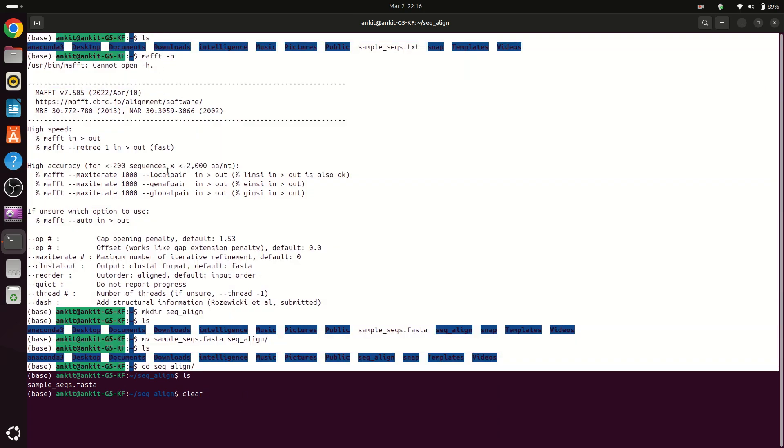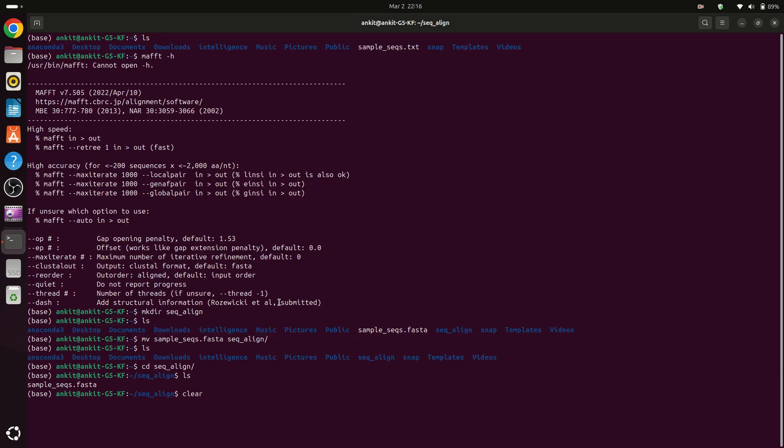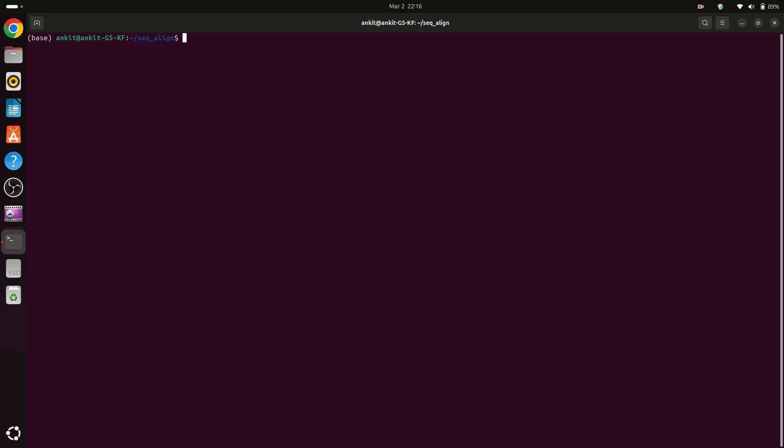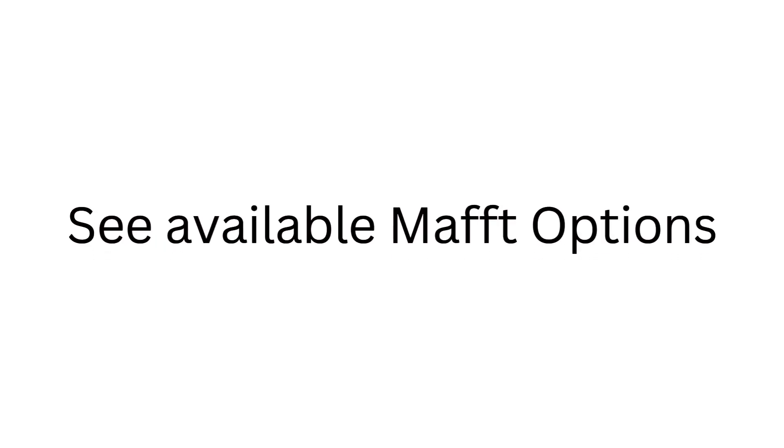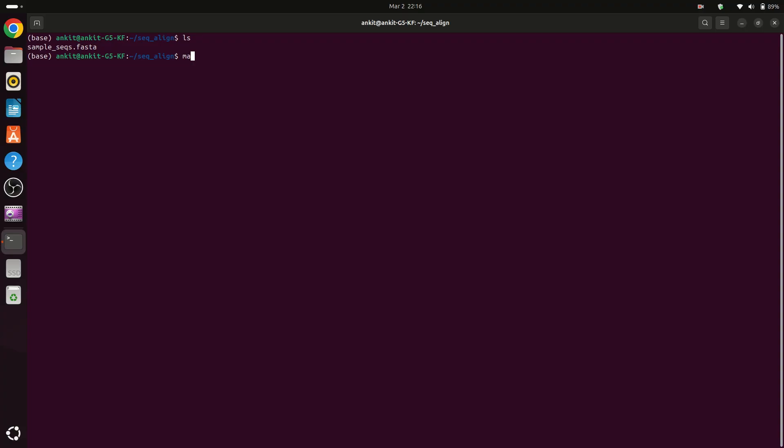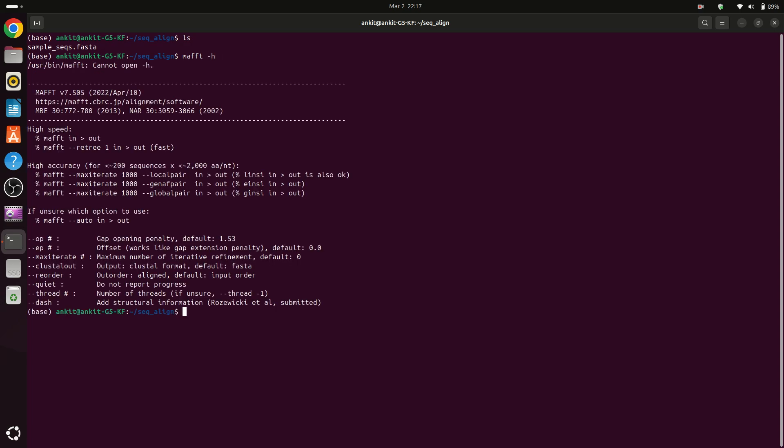Now as we have this file we can run MAFFT. So first we will see how MAFFT works or what are the parameters in MAFFT. So here you can see that we have to run MAFFT. We have to type MAFFT for calling MAFFT in our terminal, then we have to provide our input file which is FASTA and then the name of output file.